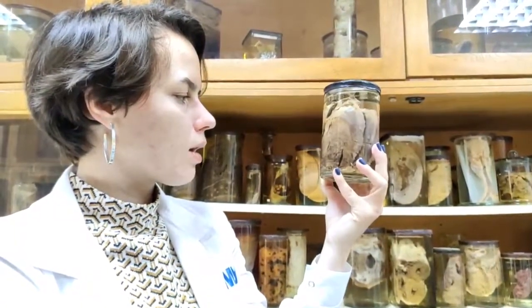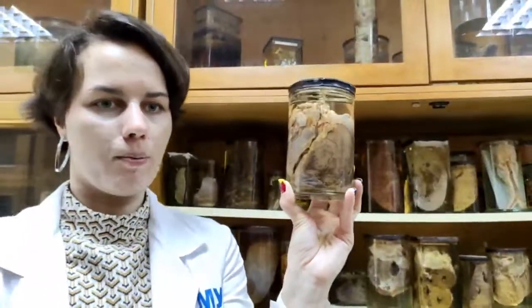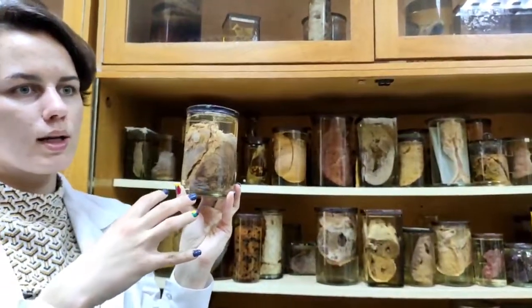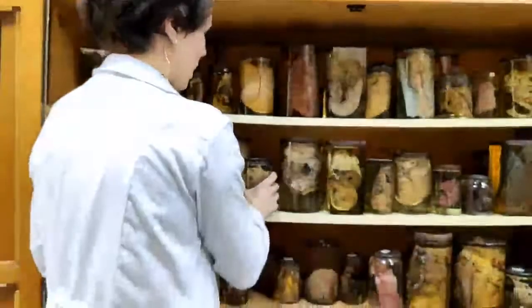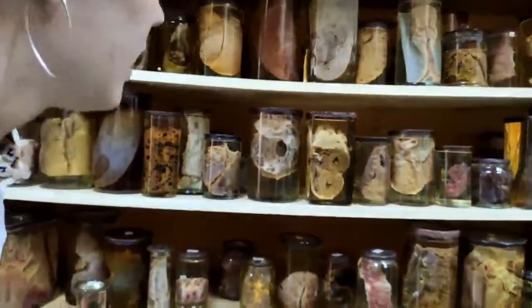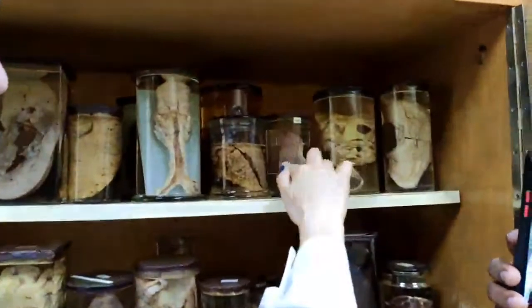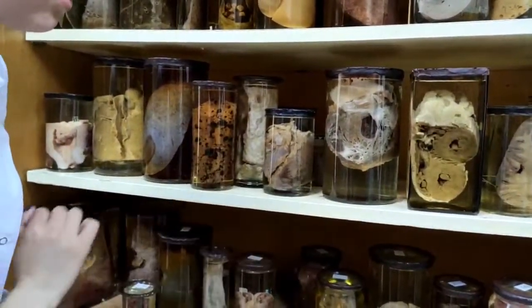And the shape of this infarction is irregular because, for example, kidney has a very symmetrical type of branching of the blood vessels. It's not the situation in the heart because we can see these coronary blood vessels which have branching in different directions, and that is why when we see infarction in this organ, it's of irregular, asymmetrical shape. If infarction was in kidney, it would look maybe like this, triangular shape or something. But here we see just a lot of white spots and red corolla surrounding it.